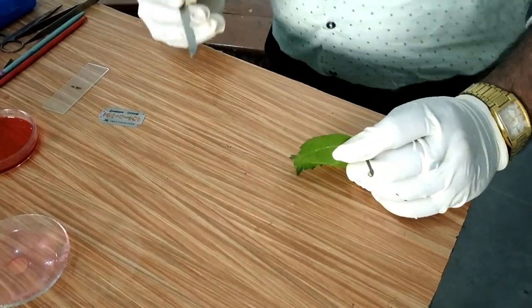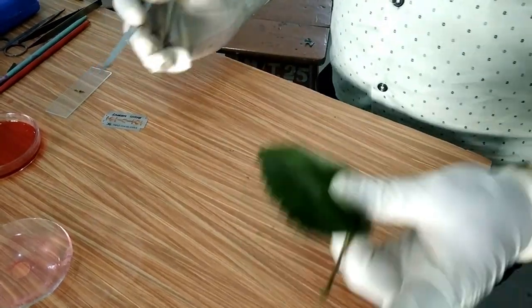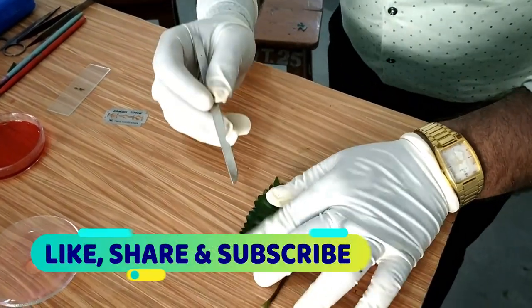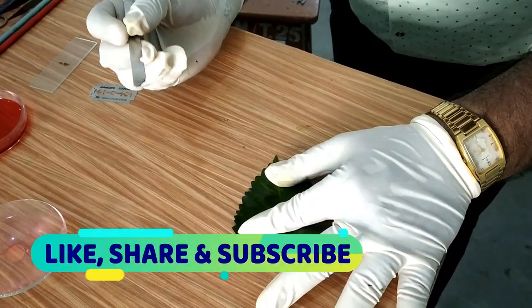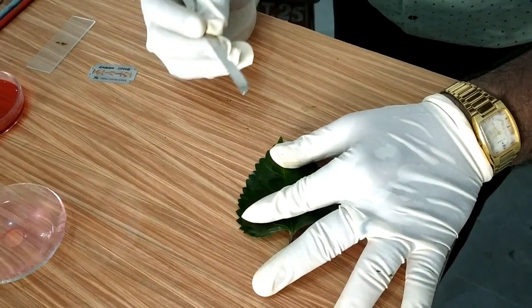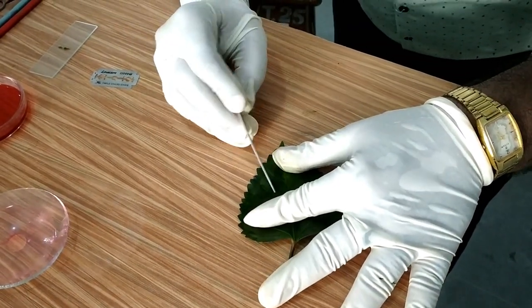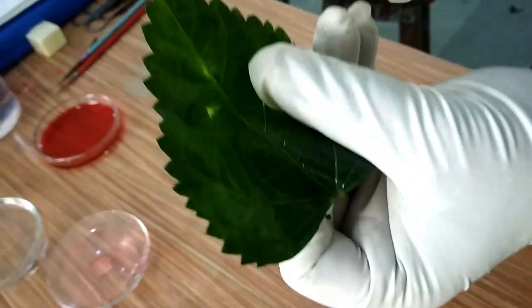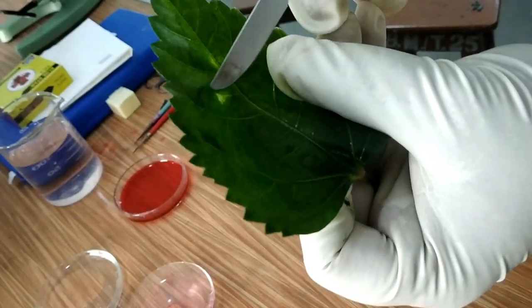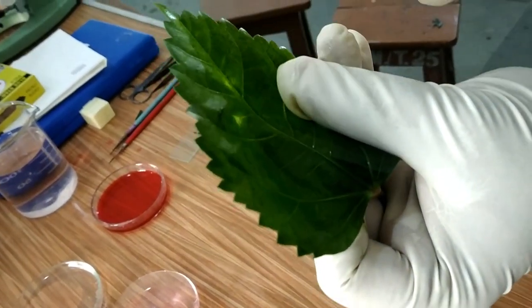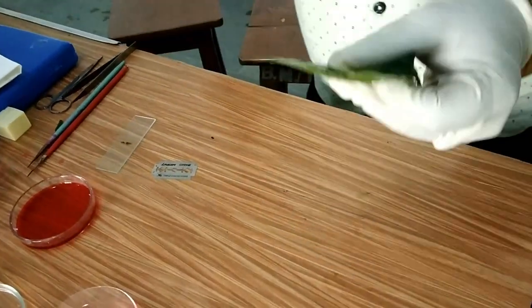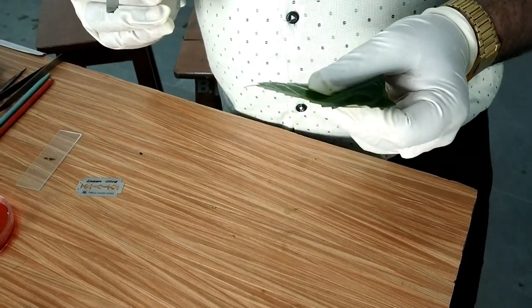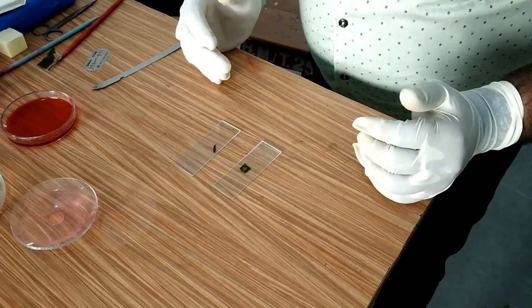Another method you can also follow: first of all, you need to take one leaf and one forceps. What to be done? Just hold that leaf tightly and then you just scratch on the leaf with the help of this forceps. After scratching, you can see very easily you can get epidermal peel by this step.